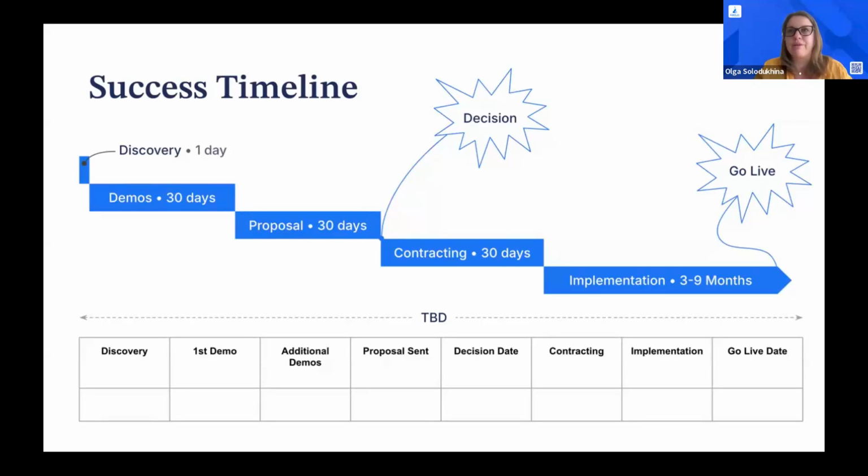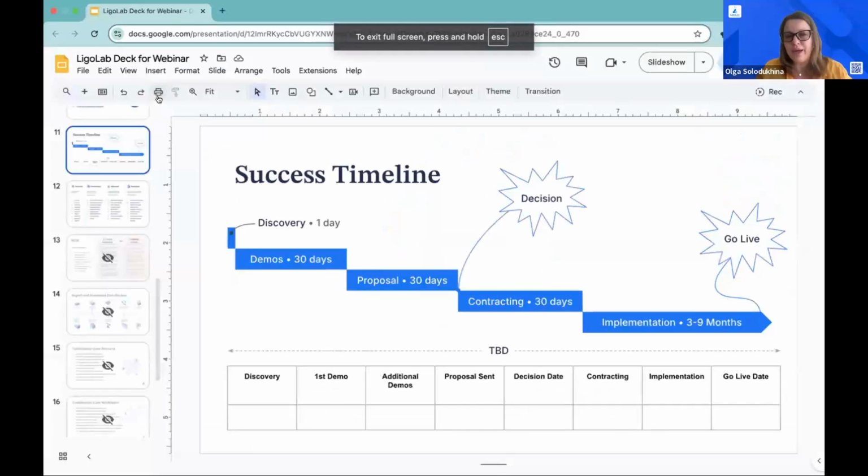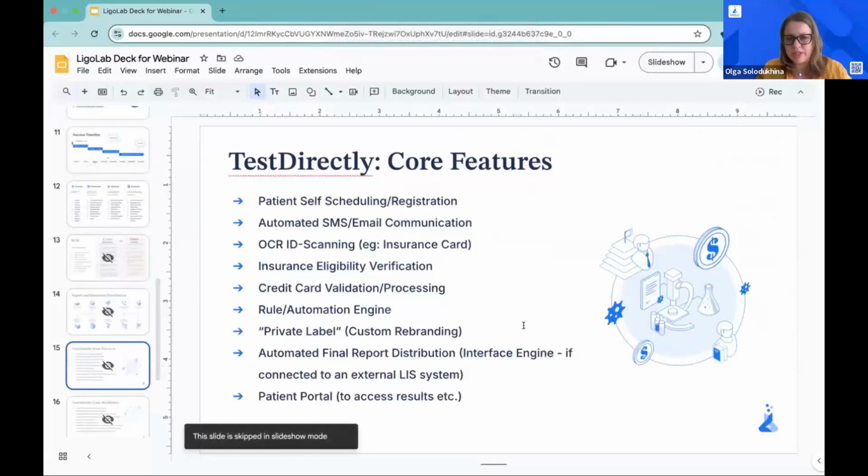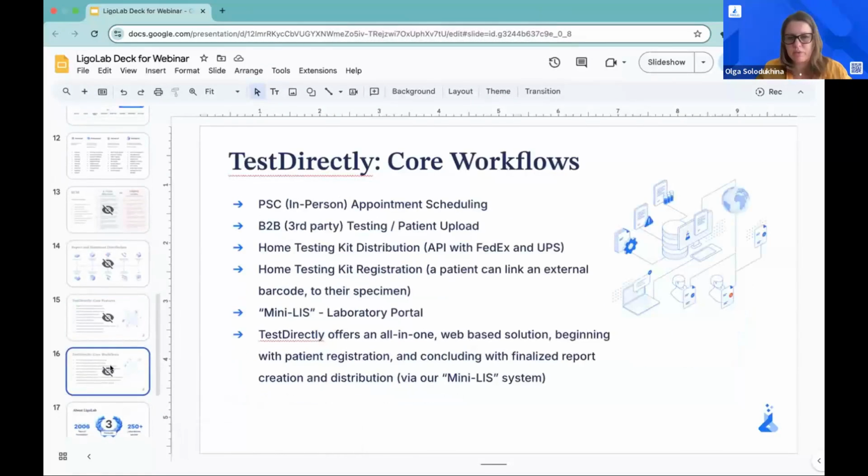Let's say you have testing in the kits that you're sending to your clients. We have a solution for that too. Probably it's hidden in my presentation, but just to give you the gist of what it does, here are the workflows that we can cover. We can do coverage for in-person appointments or third-party testing and home kit distribution, things like that.